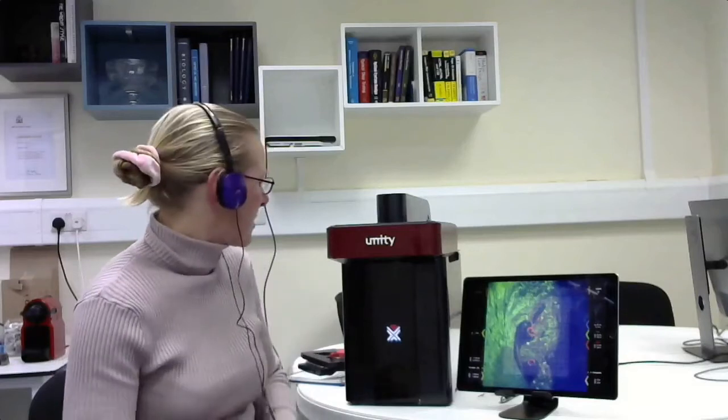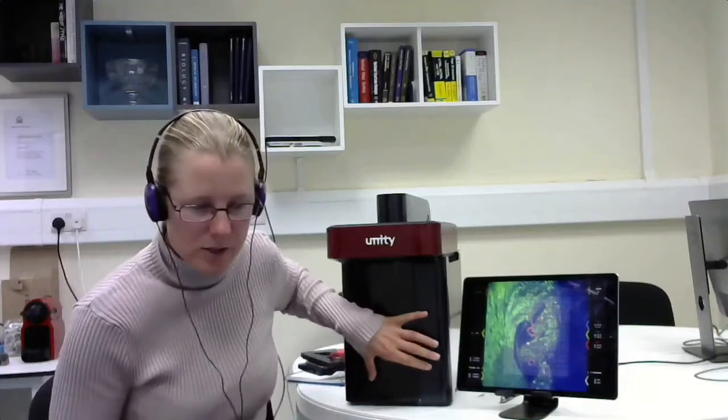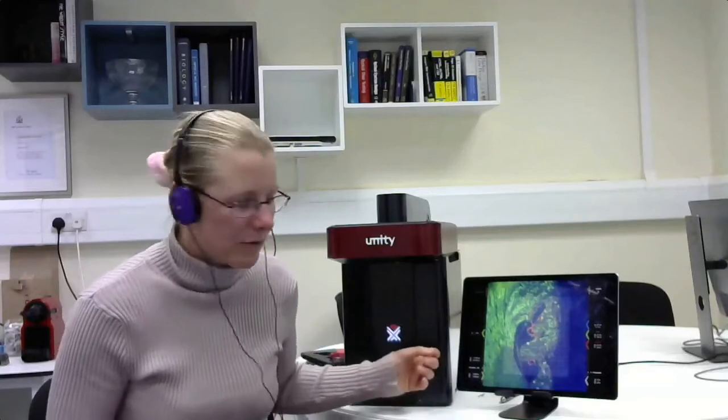There are various ways to get your data off the instrument. You can collect data onto the integrated hard drive and then remove it via a portable hard drive, or you can network the instrument, or even do it over Wi-Fi, though that's a little slow. You can attach a hard drive to the back and have the instrument automatically saving to it, or save to a network. There's quite a lot of hard drive storage on there, so you should be able to run quite a long experiment before needing to remove your data.